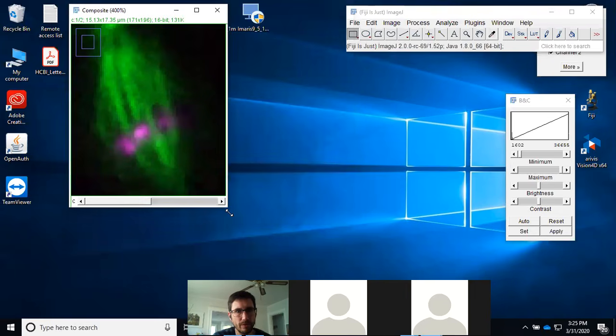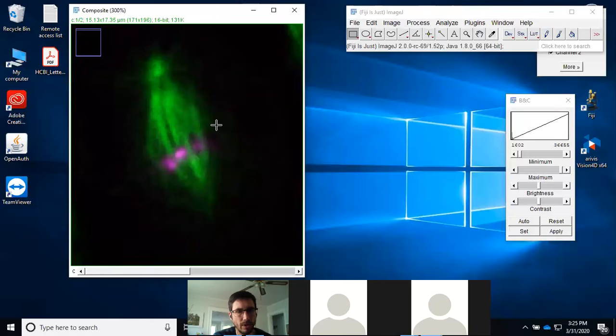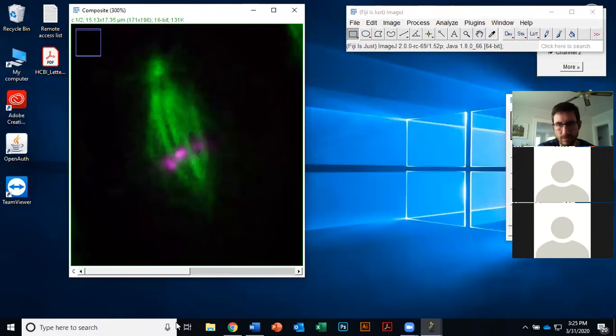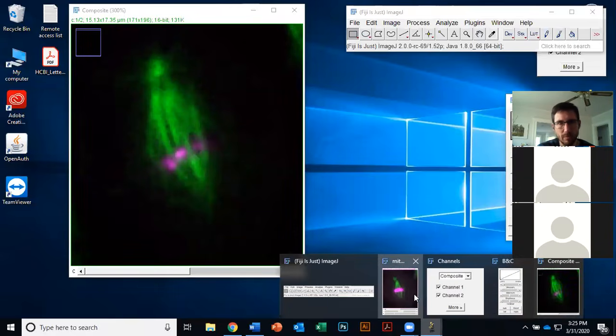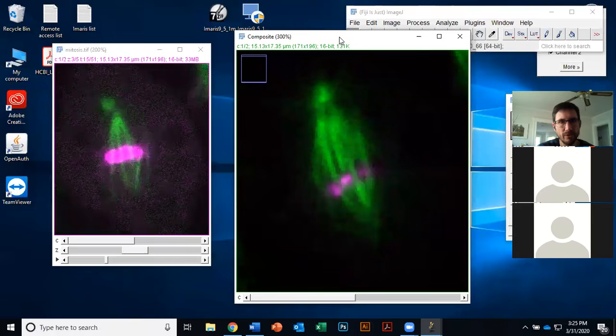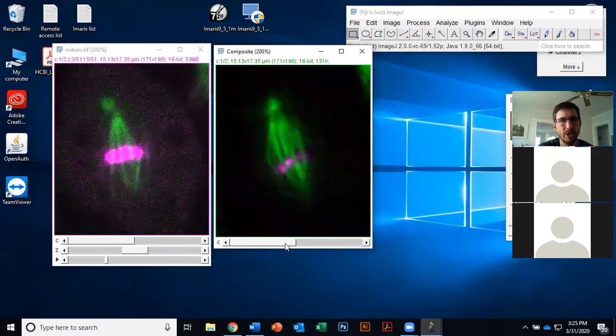Sorry, this is dancing all over the place here. What I want to do is compare that back to this. So there's the original image that we started with, and here's what we've got to now, just with one pretty simple filtering step.